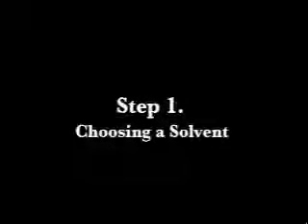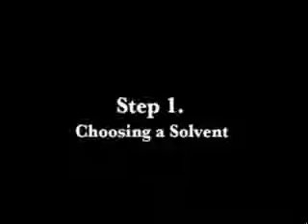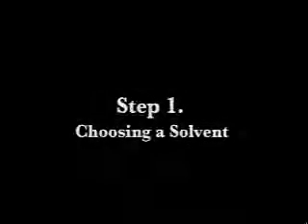Choosing an appropriate solvent for a recrystallization is a very important step. You won't get acceptable results if you don't pick carefully. It is helpful to have a variety of solvents at your disposal. If solubility data for your compounds has been published, this will help you to narrow the range of potential candidates. Once you have decided on a few prime contenders, you will perform solubility tests to find the ideal choice. You will need a hot water bath for the solubility tests as well as the recrystallization.